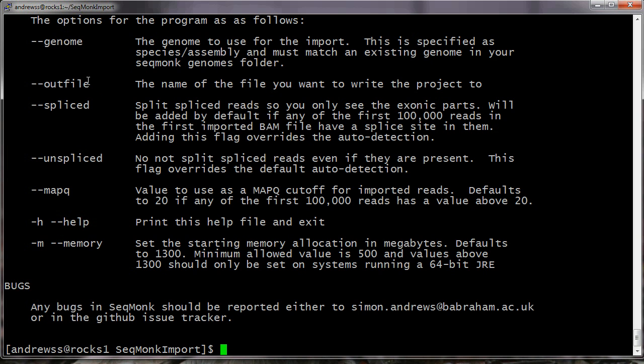We specify the name of the output file that we want the project to go into. By default, the program will look into the BAM files that you're importing and will set the usual default import options. So this is exactly the same as it does in the interactive application, where if you're importing RNA-seq data, it will put the spliced flag on so that it splits up spliced reads into the exonic parts.